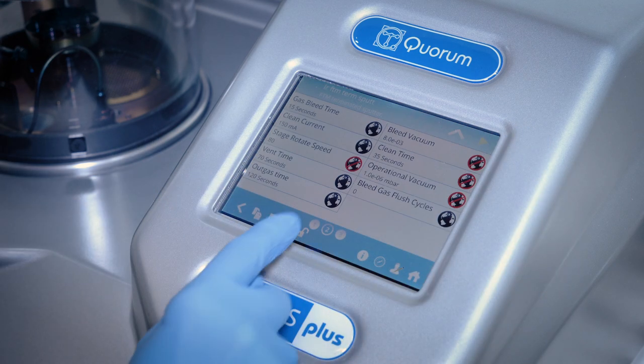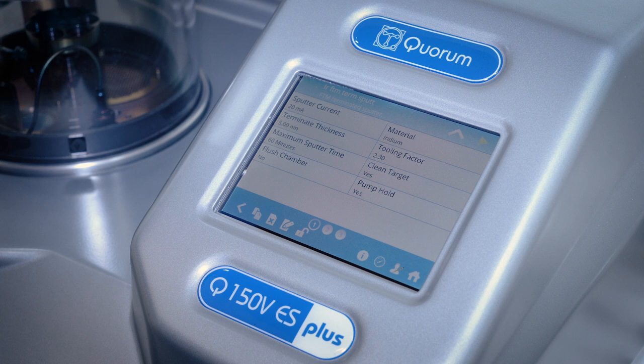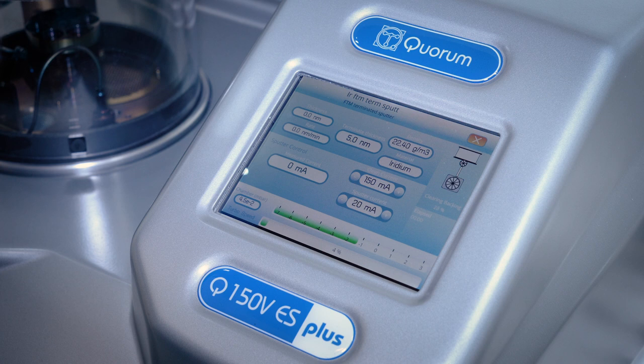After editing these key parameters, the machine is ready to run. By pressing the green arrow, we activate the recipe and the coating process starts.